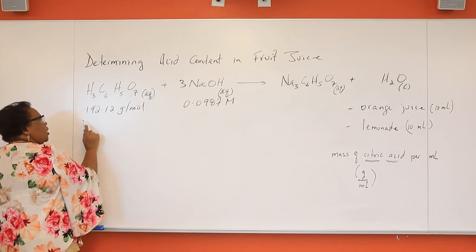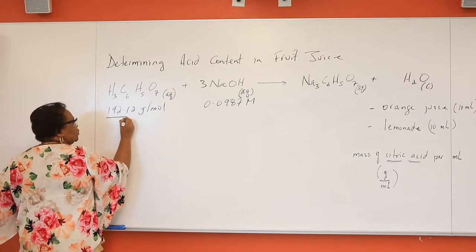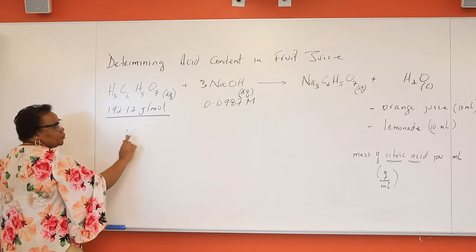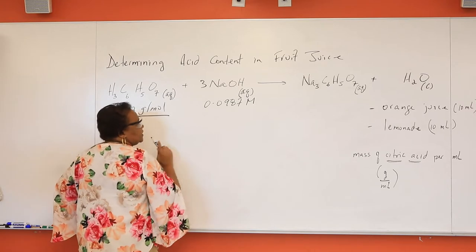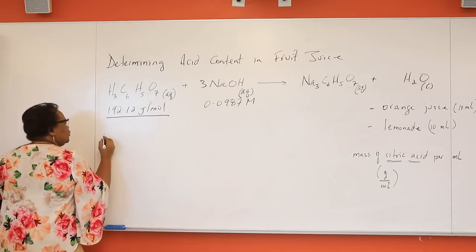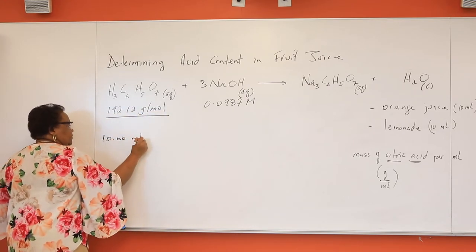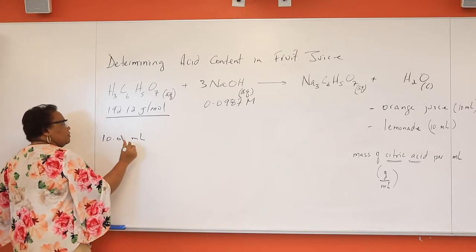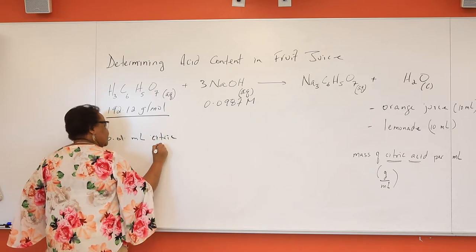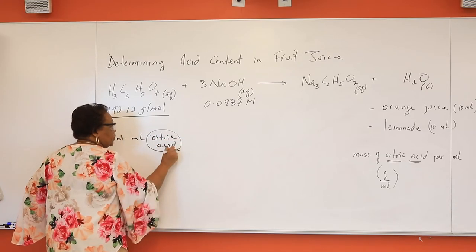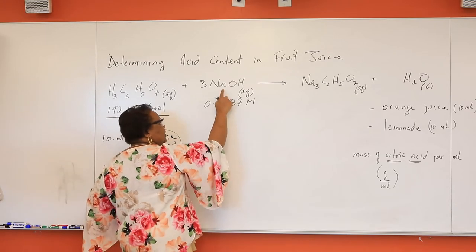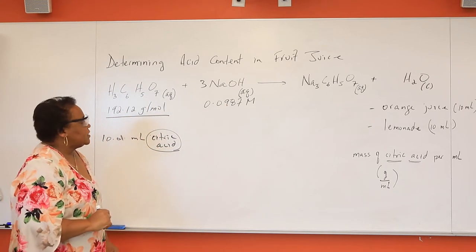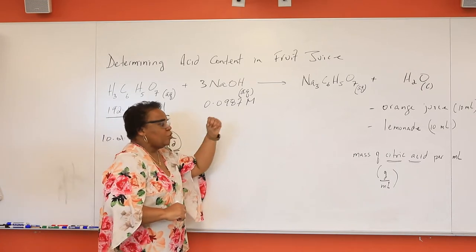Just as before, our acid which is citric acid, here is the molar mass. We can determine that concentration in grams per milliliter by means of a titration. We are measuring our 10 ml, just one decimal place because I am using a graduated cylinder, 10 ml of our citric acid. I am going to be titrating that with sodium hydroxide. You are given the molarity of your sodium hydroxide solution. It is 0.098 molar.